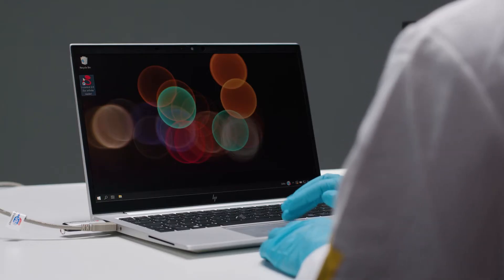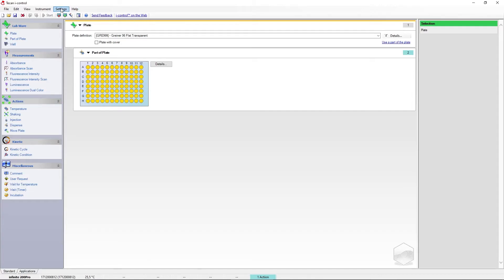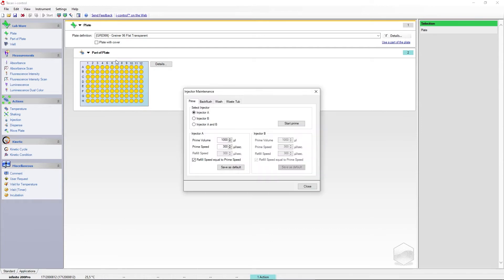We will now show you how to prime using the iControl software. In the iControl software you can find the injector options under Settings, then Injector. Select the injector you want to adjust the priming parameters for. Two different tube lengths are available.